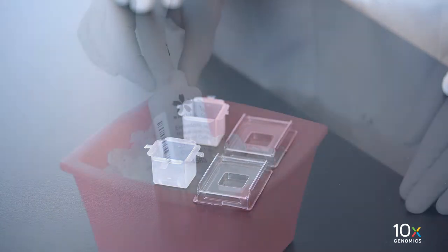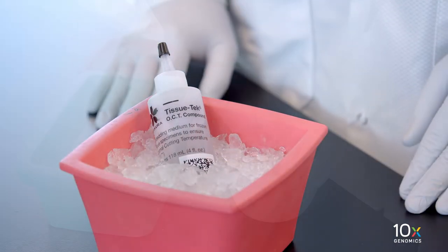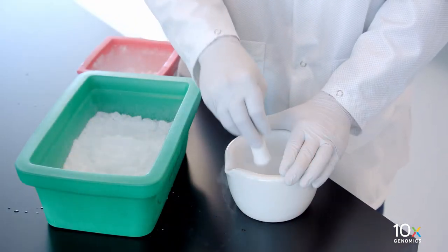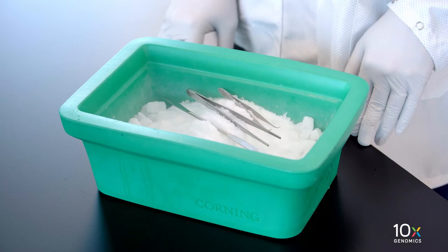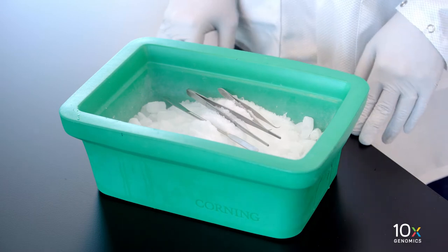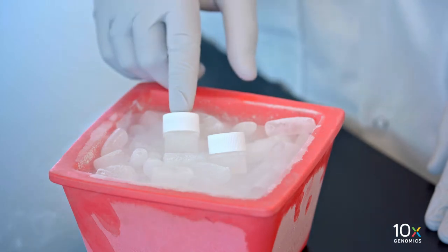We are ready to OCT embed our frozen tissue. We have a cryo mold for embedding, chilled OCT that has been on ice for at least 30 minutes, powdered dry ice that we've made with a mortar and pestle, specimen forceps that have been pre-cooled on dry ice for at least 30 minutes, and a pre-cooled Wheaton Cryoleat cryovial.